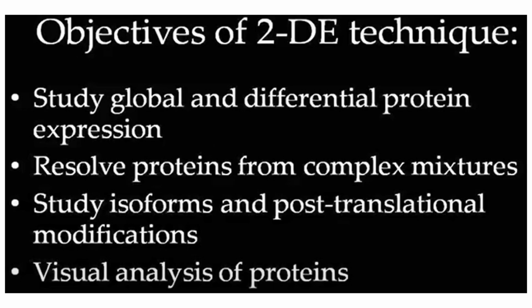So why do we do 2D gel electrophoresis? What are the major objectives? The major aims are to study global and differential protein expression and to resolve proteins from a complex mixture.